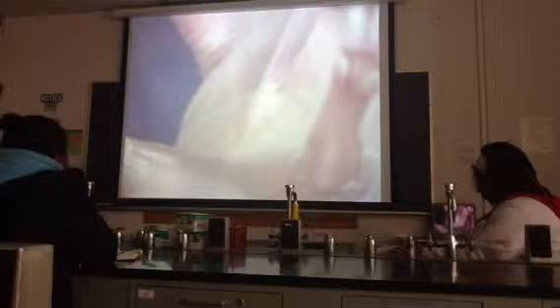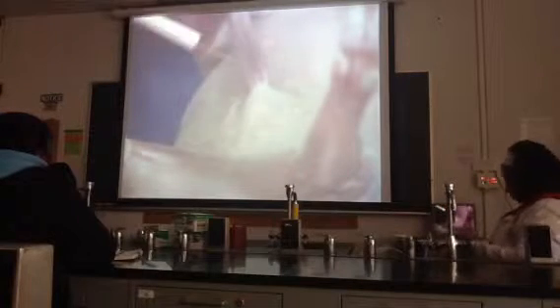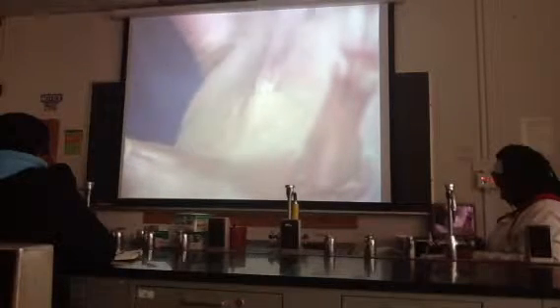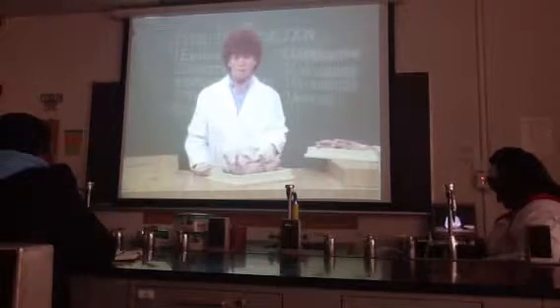In both the male and female fetal pig, note the two rows of mammary papillae. In the next section, we will begin the dissection of the fetal pig.